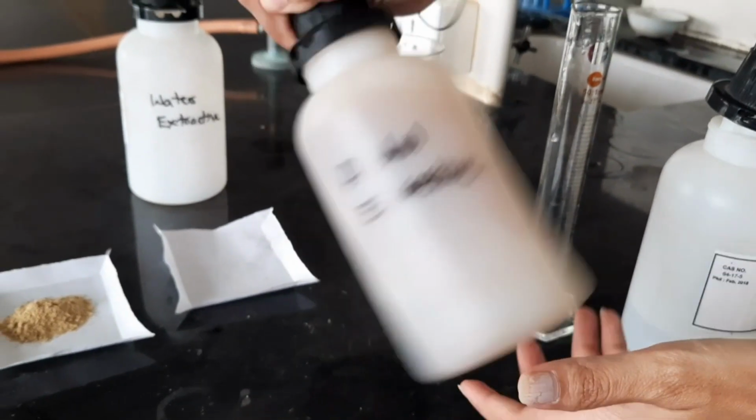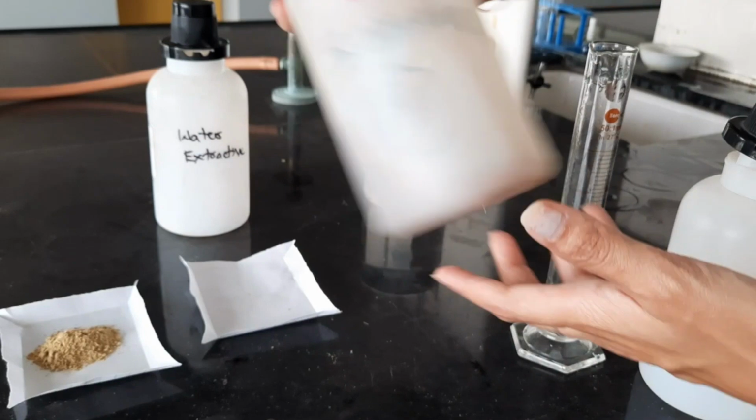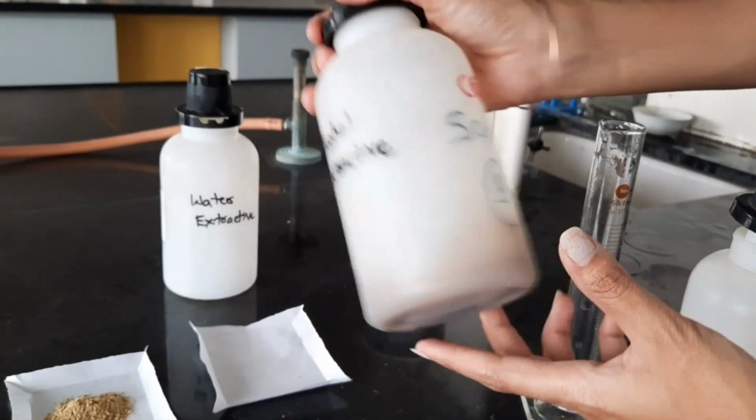And we'll shake this. We have to shake this for 3 to 4 hours or 6 hours continuously with some time interval.